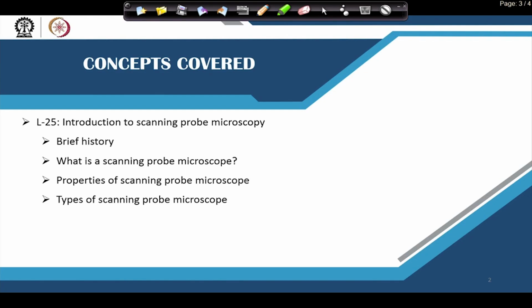In this lecture, I will introduce you to scanning probe microscopy: the basics, a brief history, what a scanning probe microscope is, properties of the scanning probe microscope, and different types of scanning probe microscope.